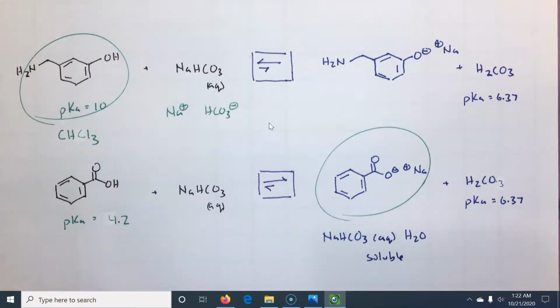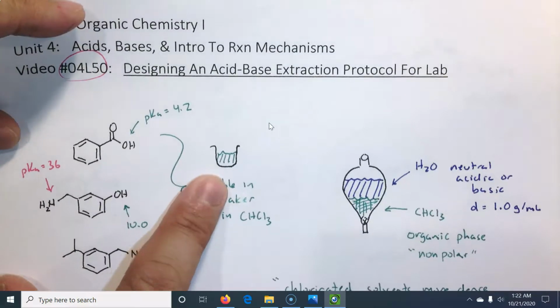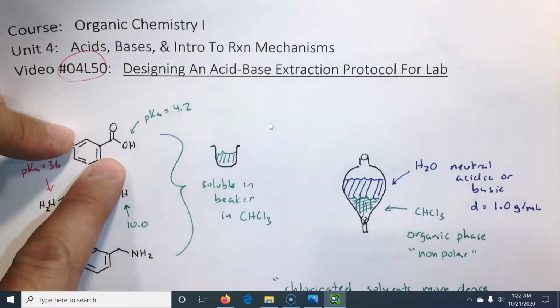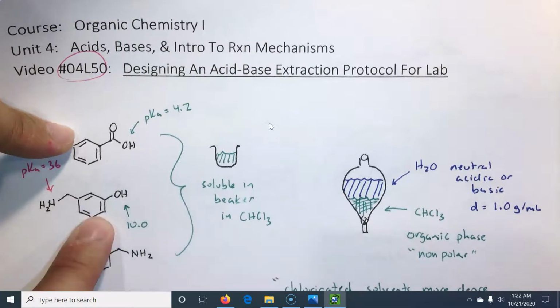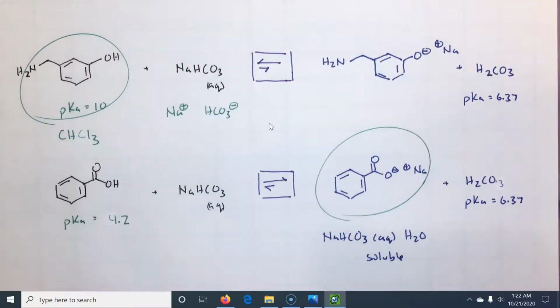Think about your separatory funnel. If I do sodium bicarbonate, I could get this molecule to go into the water layer, but not this molecule, not the second molecule. And we proved it right here. Okay.